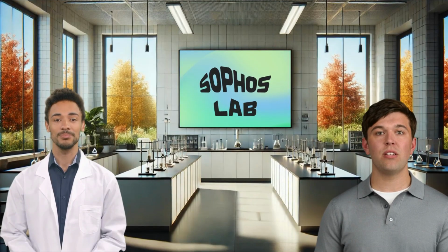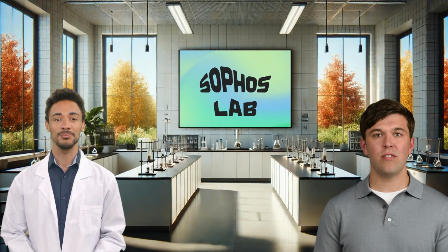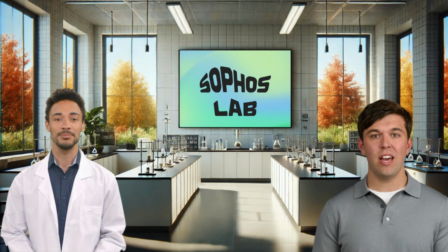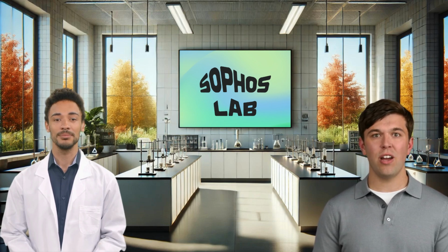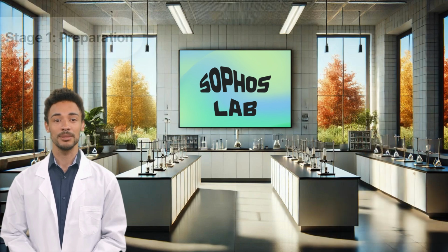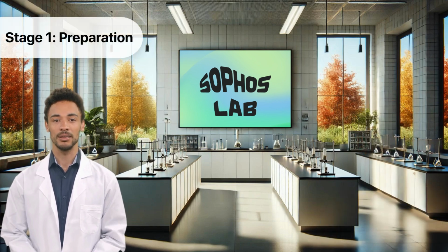Let's set up our experiment to investigate how light intensity affects the rate of photosynthesis in an aquatic plant. Carefully follow the steps to ensure we achieve accurate and reliable results. Sam will go through the steps with you. Over to you, Sam. So for this practical, first we set up the plant.